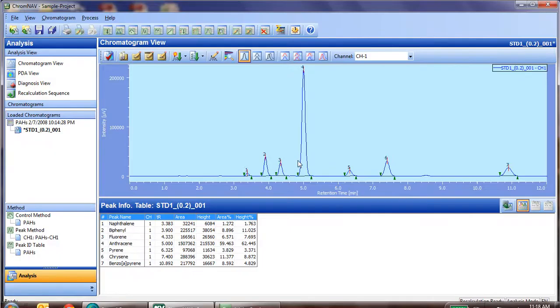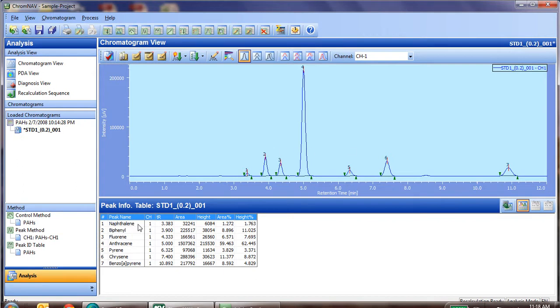Now, system suitability is quite easy in ChromeNav. So after we've opened a piece of data, we'll notice in this case that it already has been integrated and the peaks have been named. So at that point, we're ready to create our system suitability test.